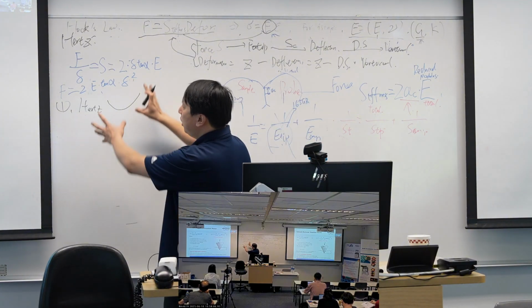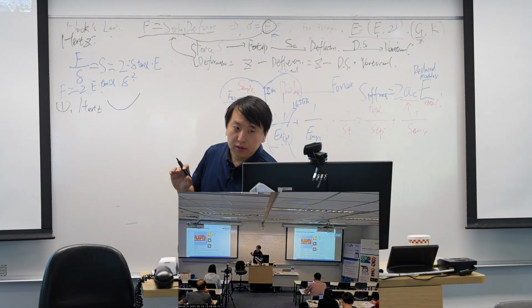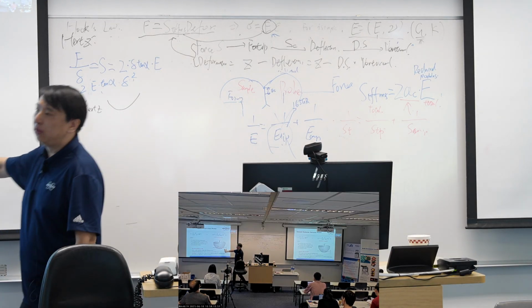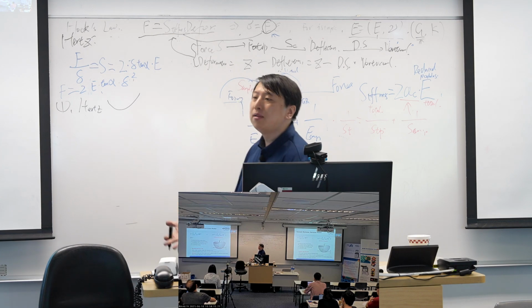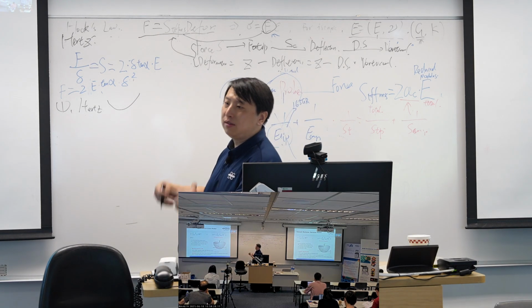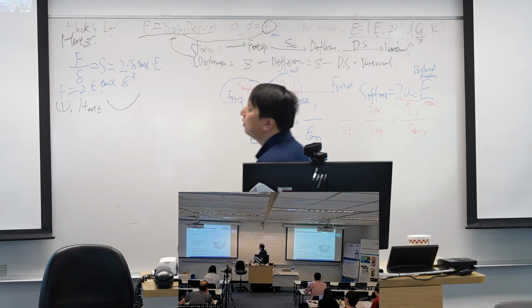And if I'm using a sphere to indent my sample, and my sample, I think of it also as a sphere, but the radius is infinite, okay?